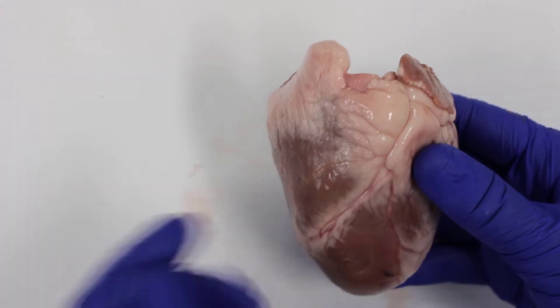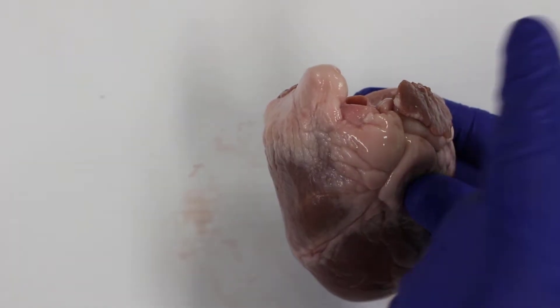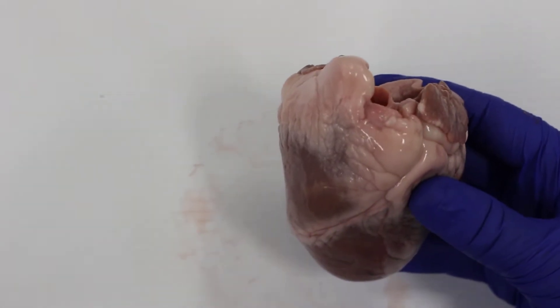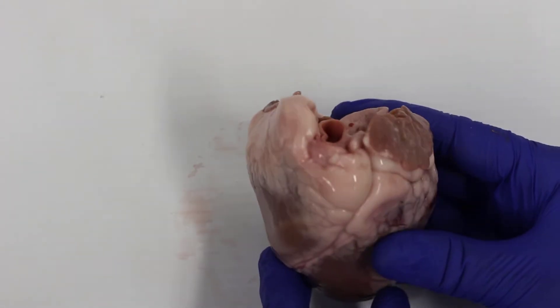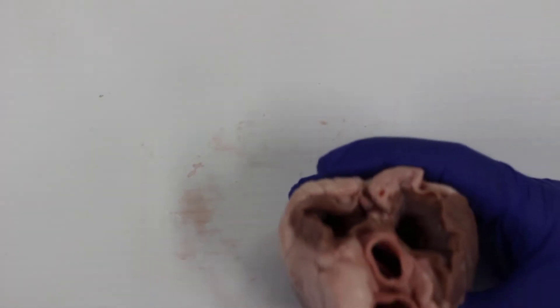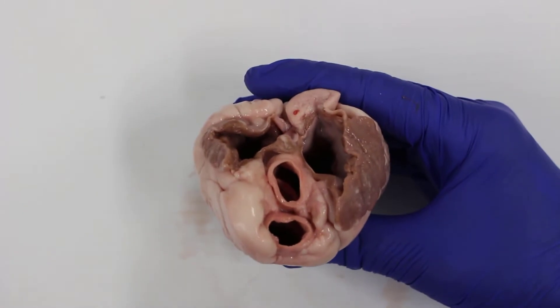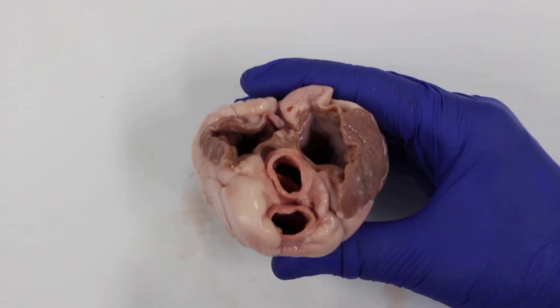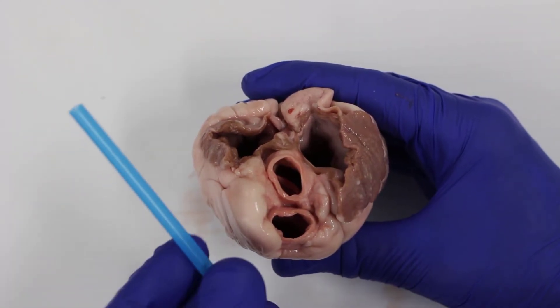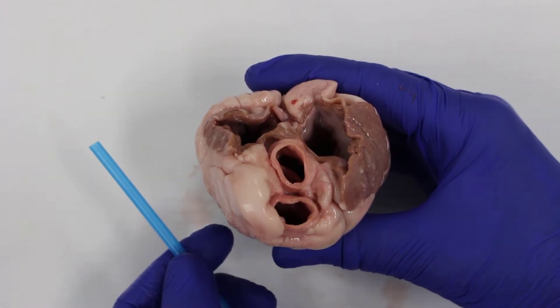The larger vessels without those thick walls are veins — they carry blood back to the heart. The heart's job is to take blood back from the body, pump it into the lungs, then take it back from the lungs and pump it around the body, pushing oxygen and other nutrients throughout. To trace the blood flow, we start with all the blood returning from the body through the biggest vein in the body, called the vena cava.